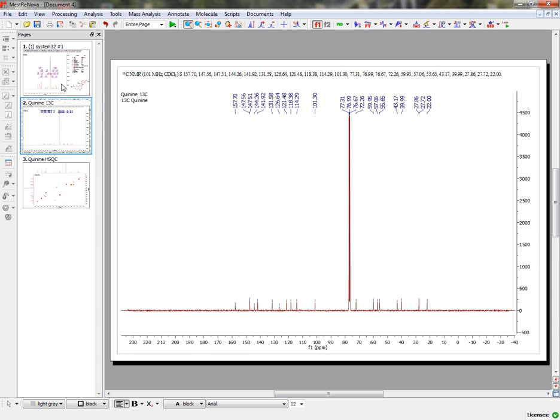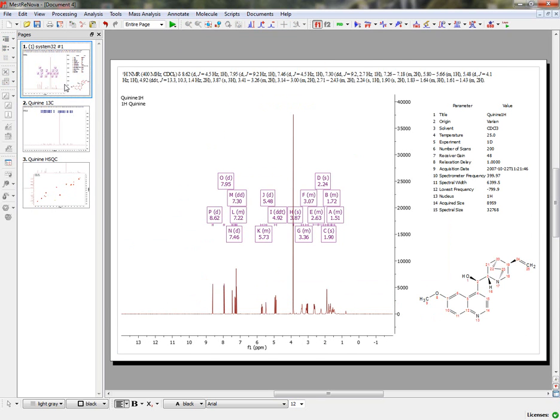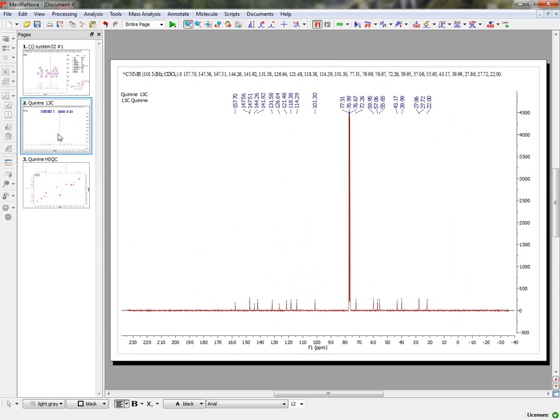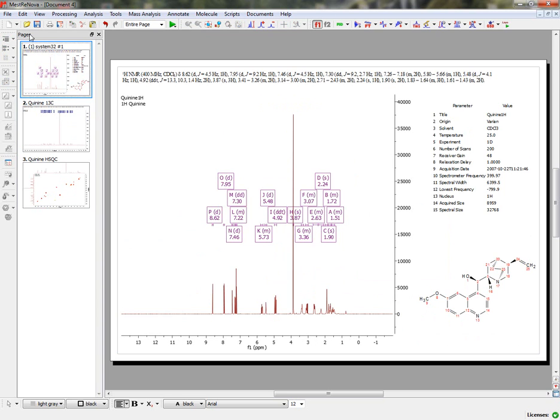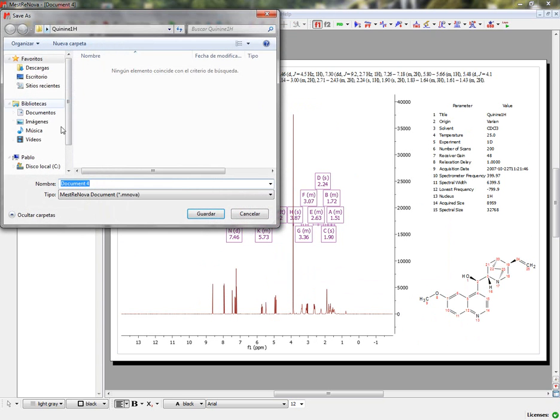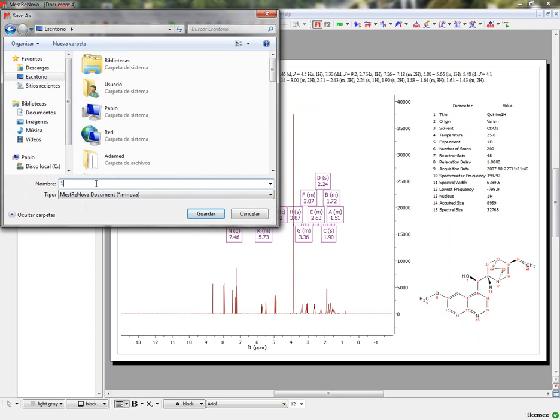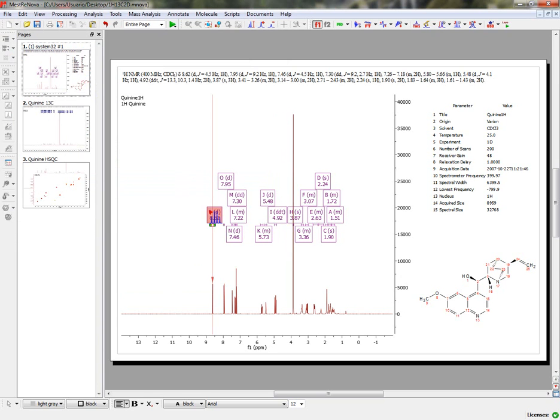And now you have in the same document the Proton, the Carbon, and the HSQC. We are going to save this document as an MNOVA document, for example, Proton Carbon 2D. And you will get in the same document all your experiments.